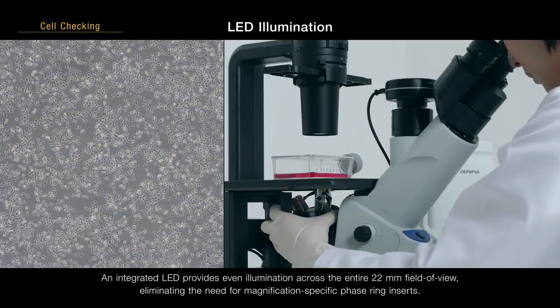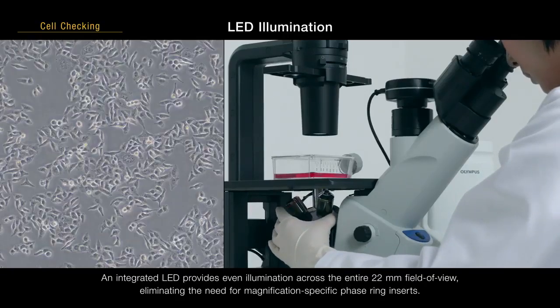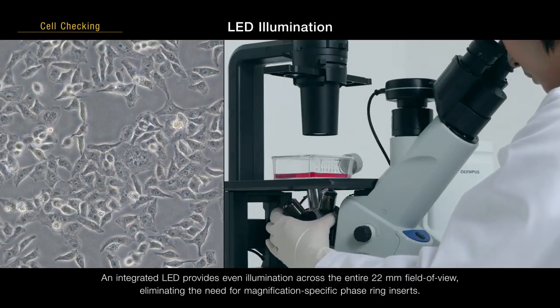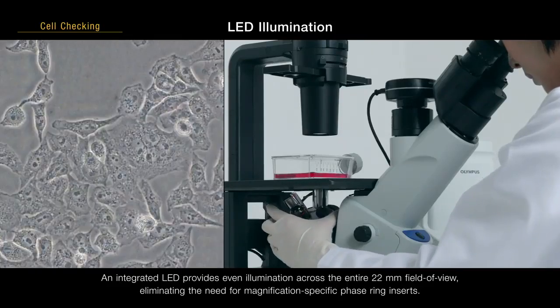An integrated LED provides even illumination across the entire 22 mm field of view, eliminating the need for magnification-specific phase ring inserts.